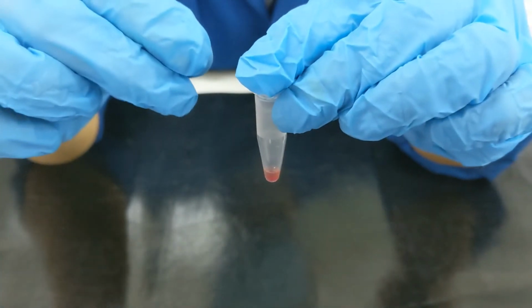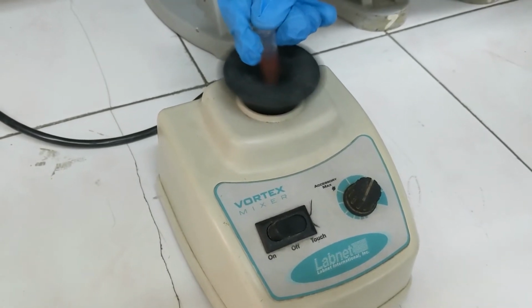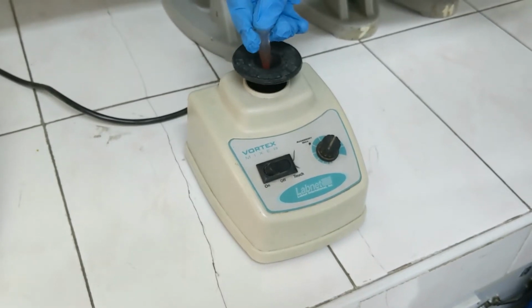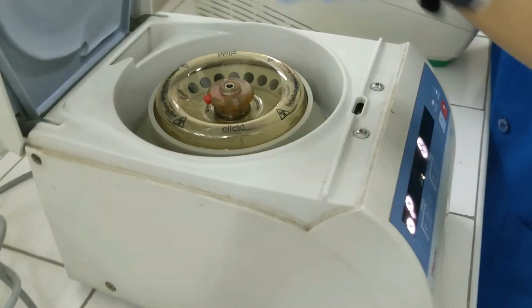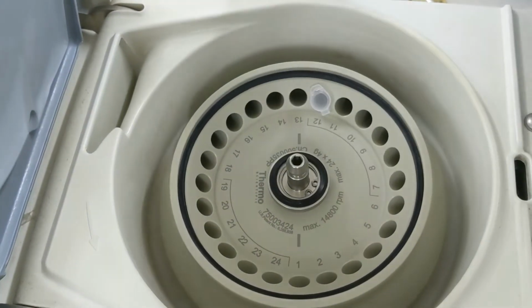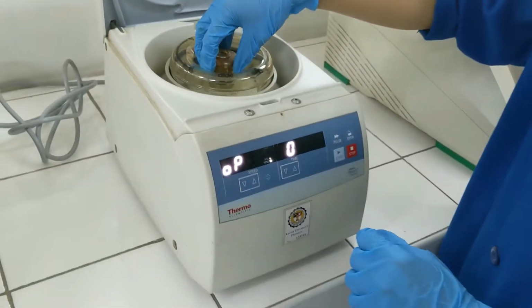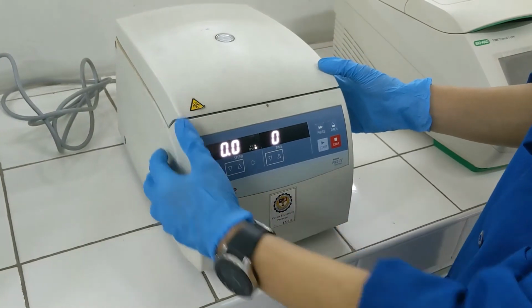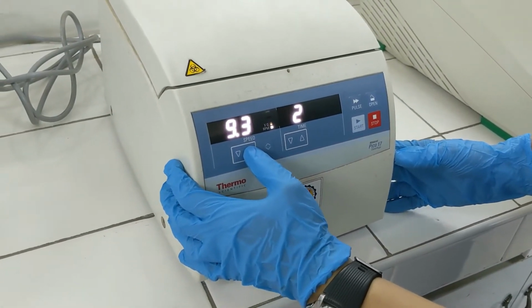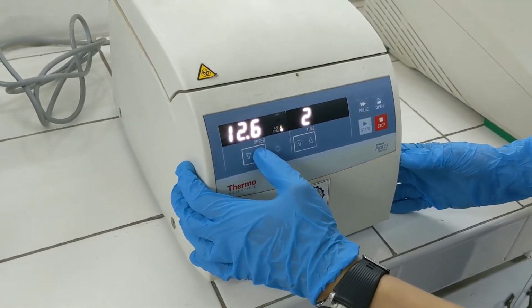And in order to make sure that the cells will lyse, we will be vortexing this mixture. And then we'll centrifuge our mixture of potassium chloride and pellet. This time at the maximum of 13,000 RPM for 5 minutes.